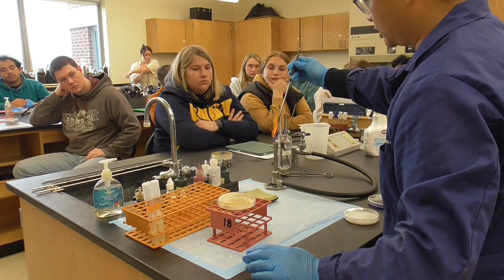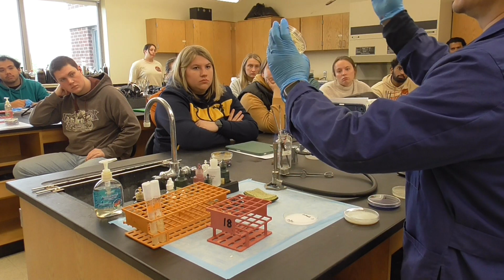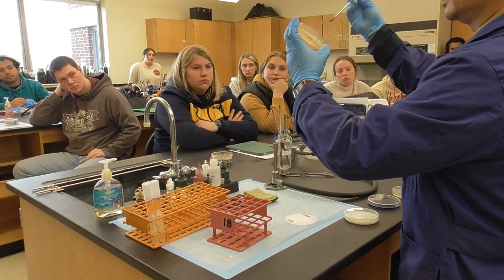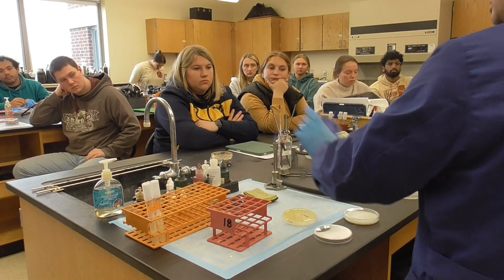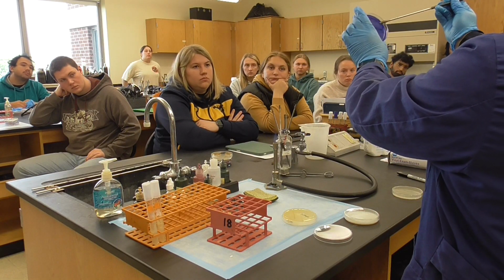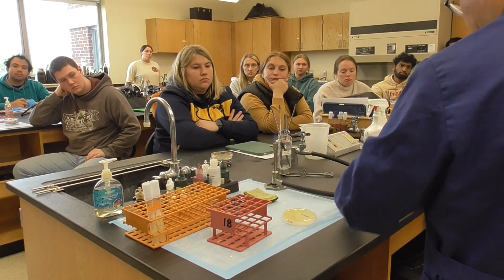Which one haven't we done? Staphylococcus aureus. It's going to be on the plates. So what you do, hold down, pick a colony. Pick up a colony, don't damage it. Then it is a very blue one. That's why I put the blue in the middle. Very gentle, we do this. That's all.